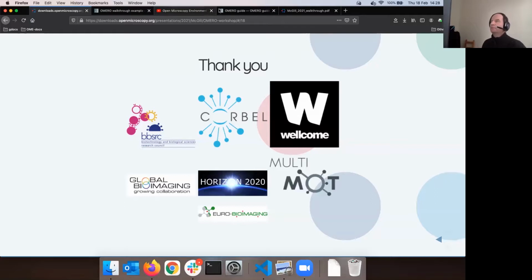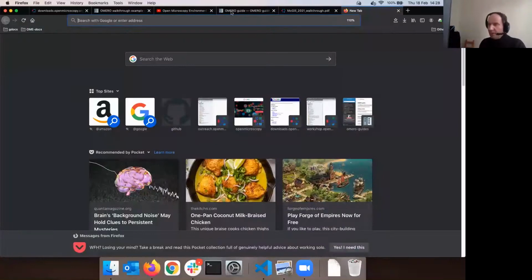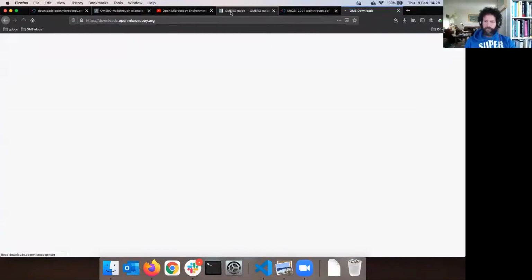And now I promised you that I will show you where this presentation is and where actually everything is. So that is the most important part. I will just open a new tab in my browser and start typing downloads.openmicroscopy.org, yes? And maybe Wilmore can ping it in the chat. Yeah, I did that already. Yes, great, thank you.